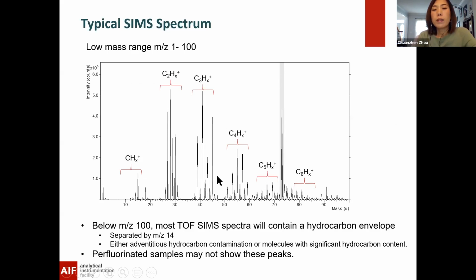And this spectrum can actually help us do the mass calibration, because sometimes when you change the reflectron or some instrument setting, your spectrum will be off a lot. When you try to find the peak at 12, which is carbon, it is actually not there. It's 12.5 or sometimes it's 11.5. But if you can find those patterns and determine, okay, this is carbon, CH, CH2, CH3, if you remember the pattern of carbon or carbon 2, then you can easily calibrate the spectrum.